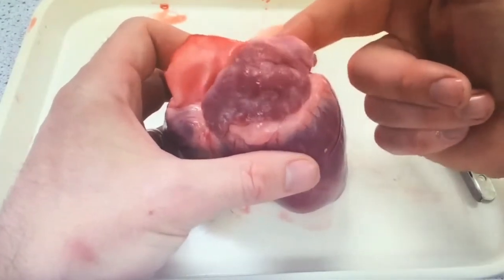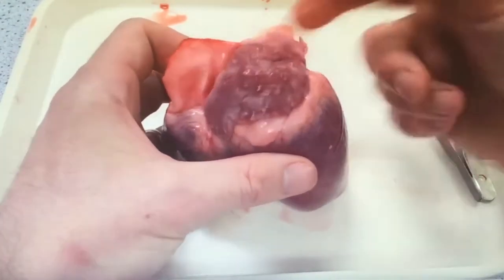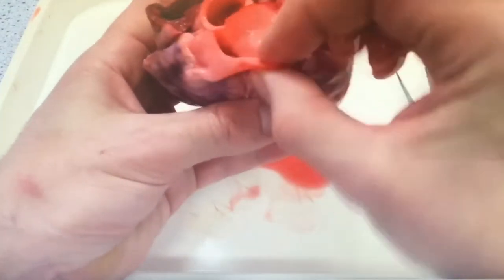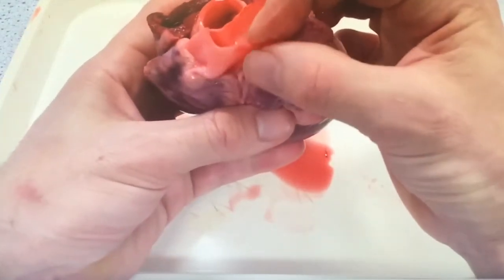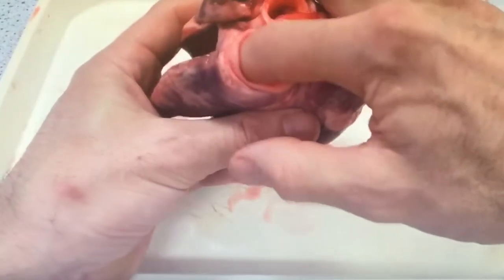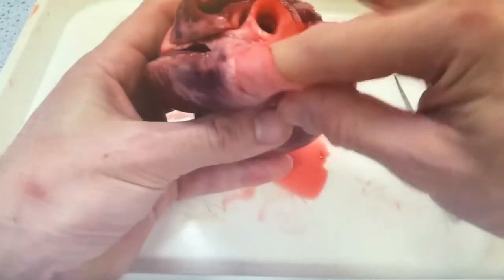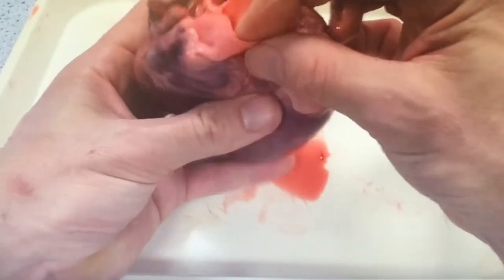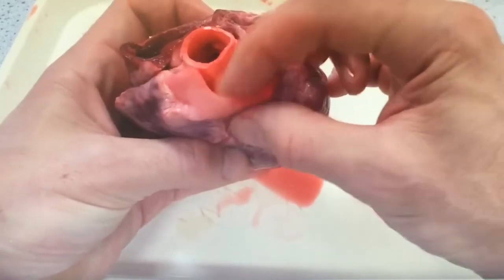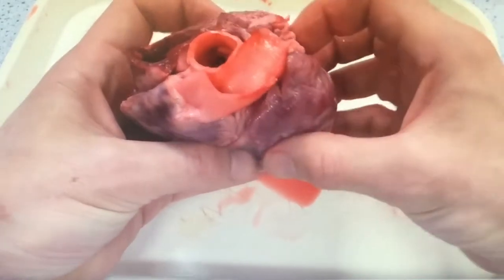It's not as thick as the left ventricle. Exploring the other blood vessel at the top, if you stick your finger all the way through there you'll end up pushing it into the right ventricle. Therefore we're able to identify that must be the pulmonary artery, which carries deoxygenated blood back to the lungs.